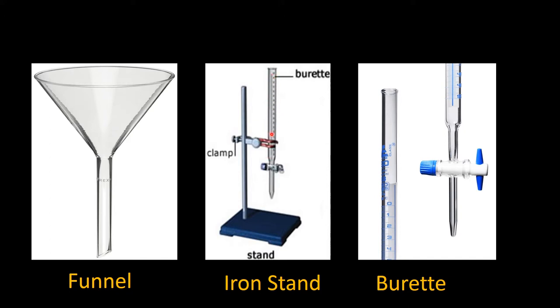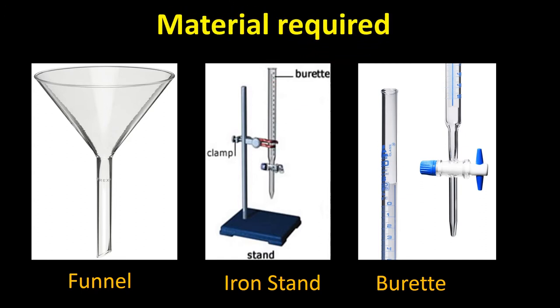Basically, the burette is an apparatus which is used in titration. Here is the tap — we open the tap slowly and carefully so that the solution flows drop by drop into the flask. The burette is calibrated, meaning we know exactly how much solution has been used, because it is marked with measured readings.